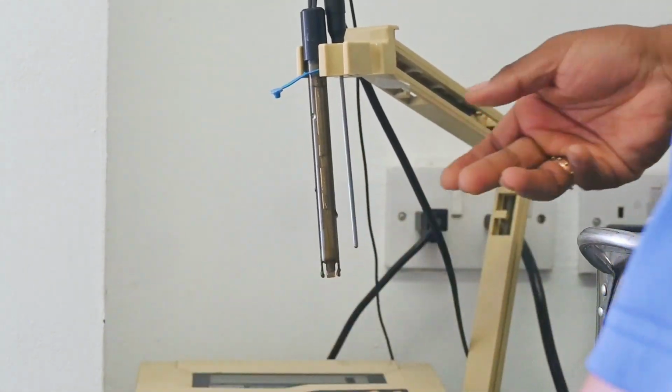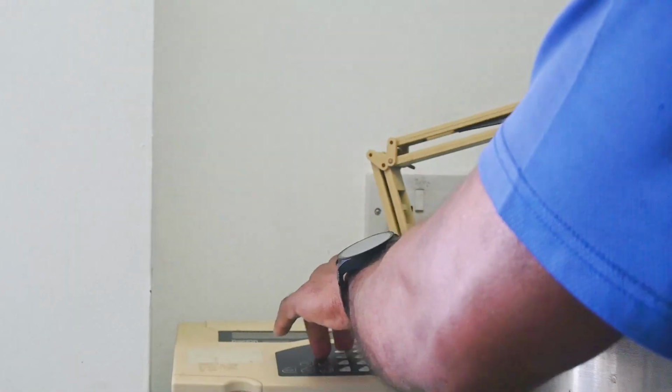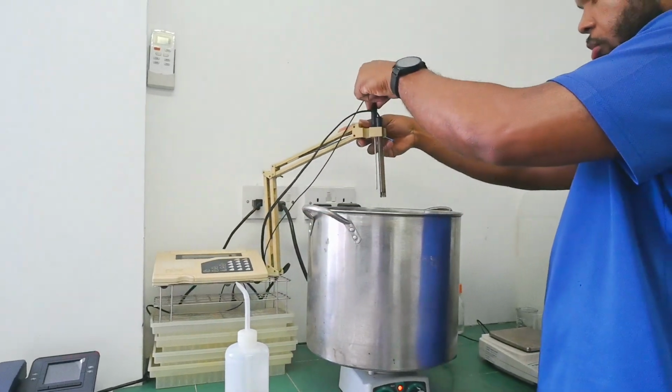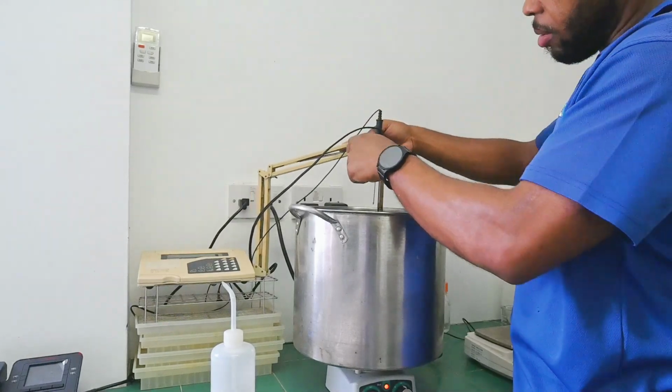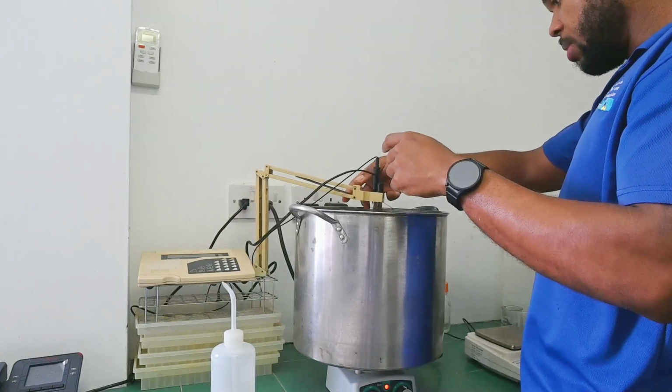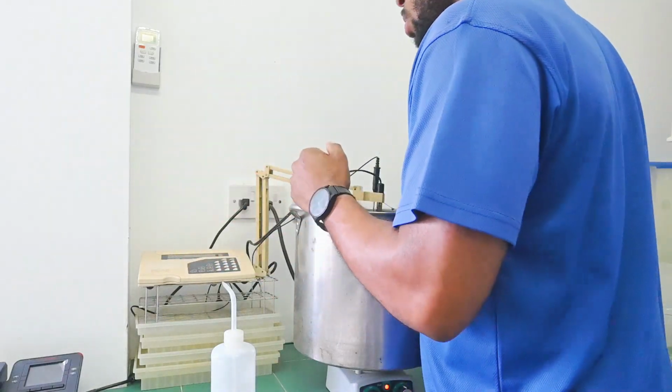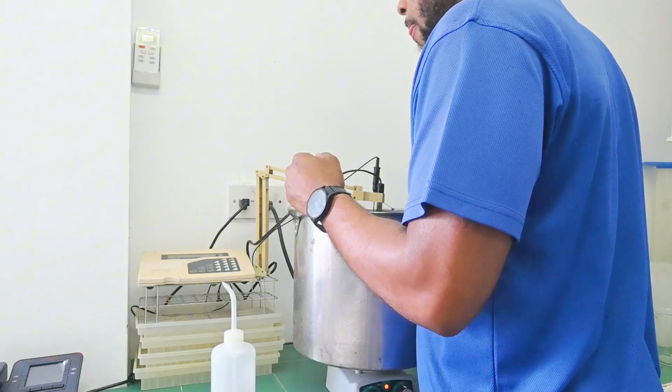Remove the excess, place it in our pan. The other probe that is in here is a thermometer, so that's what will be taking the reading. So we turn on the pH meter.